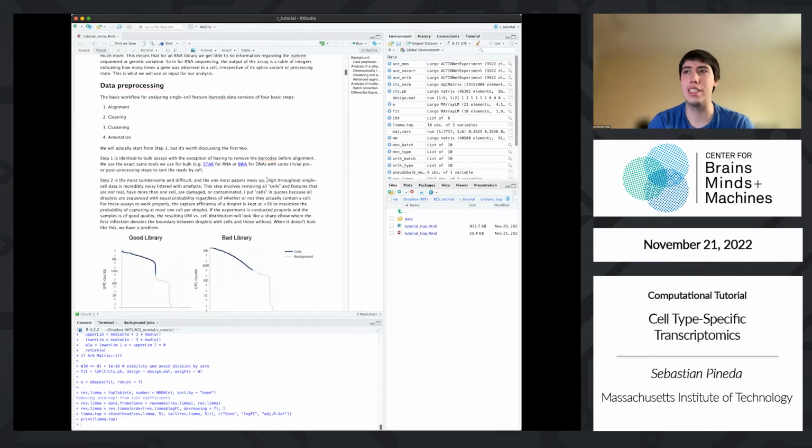People will say there are these universal metrics, like mitochondrial RNA contamination, or all these tools for finding doublets. The truth is that it's very experiment specific, right? So I can say, let me get rid of all these cells that have a lot of mitochondrial gene expression, because there shouldn't be any mitochondrial gene expression.